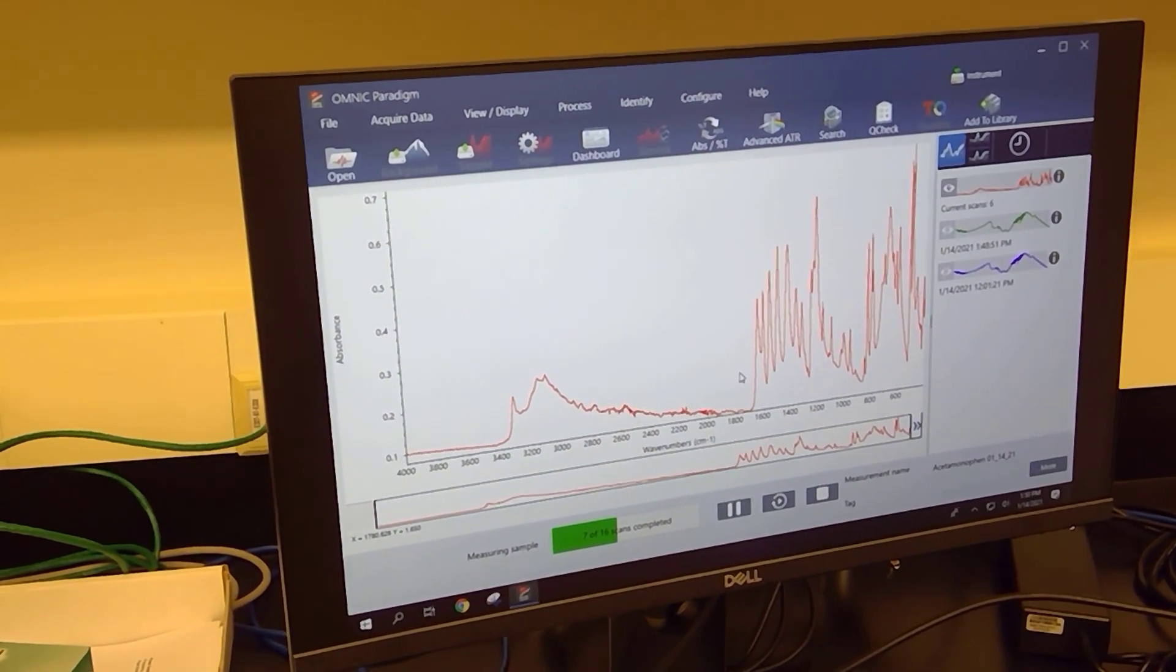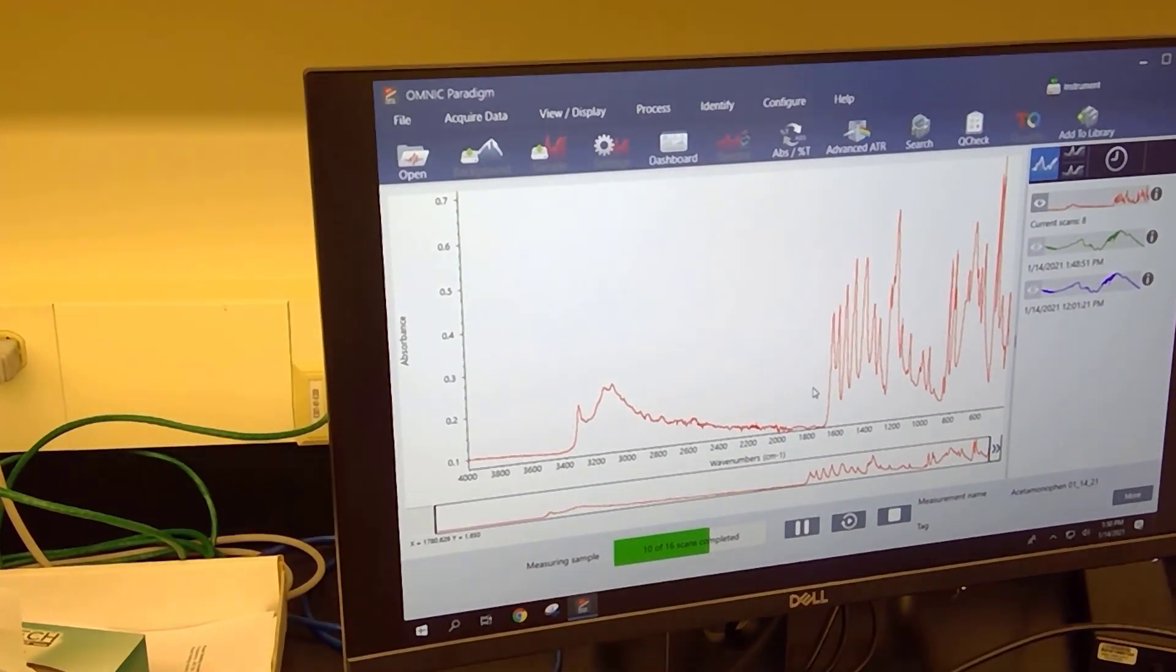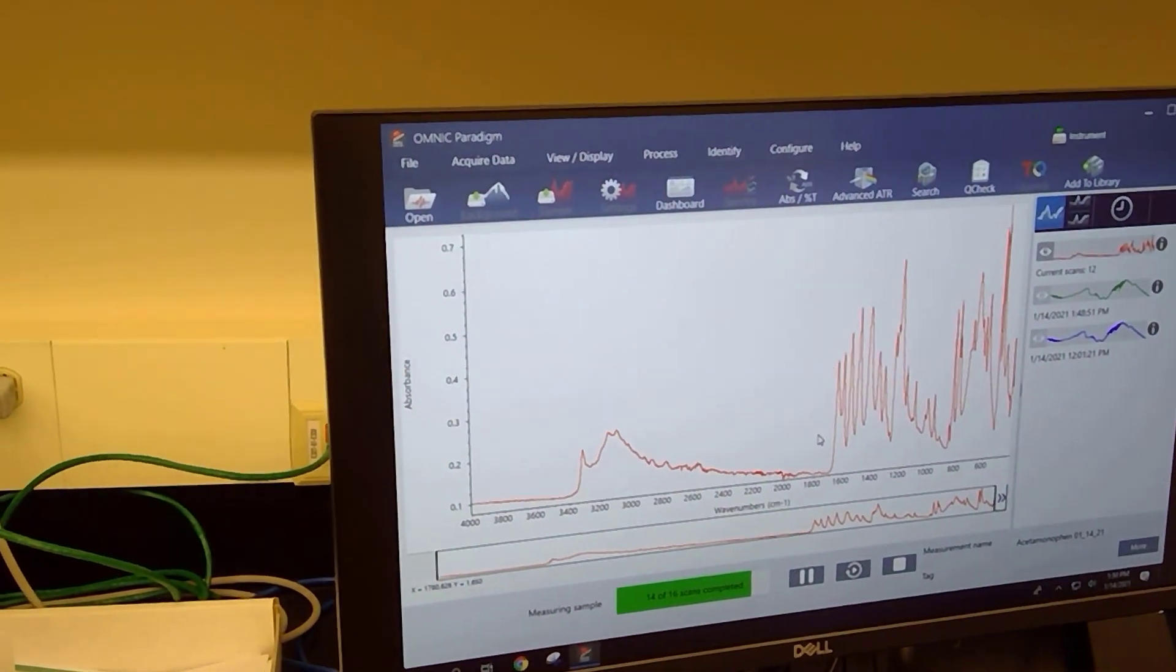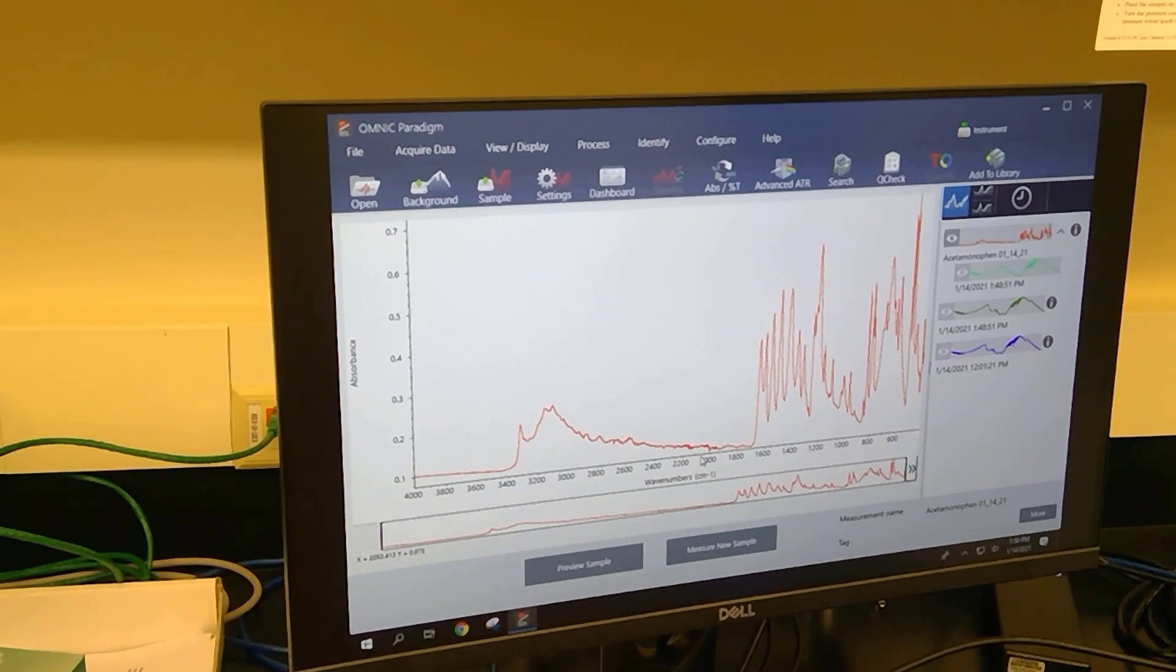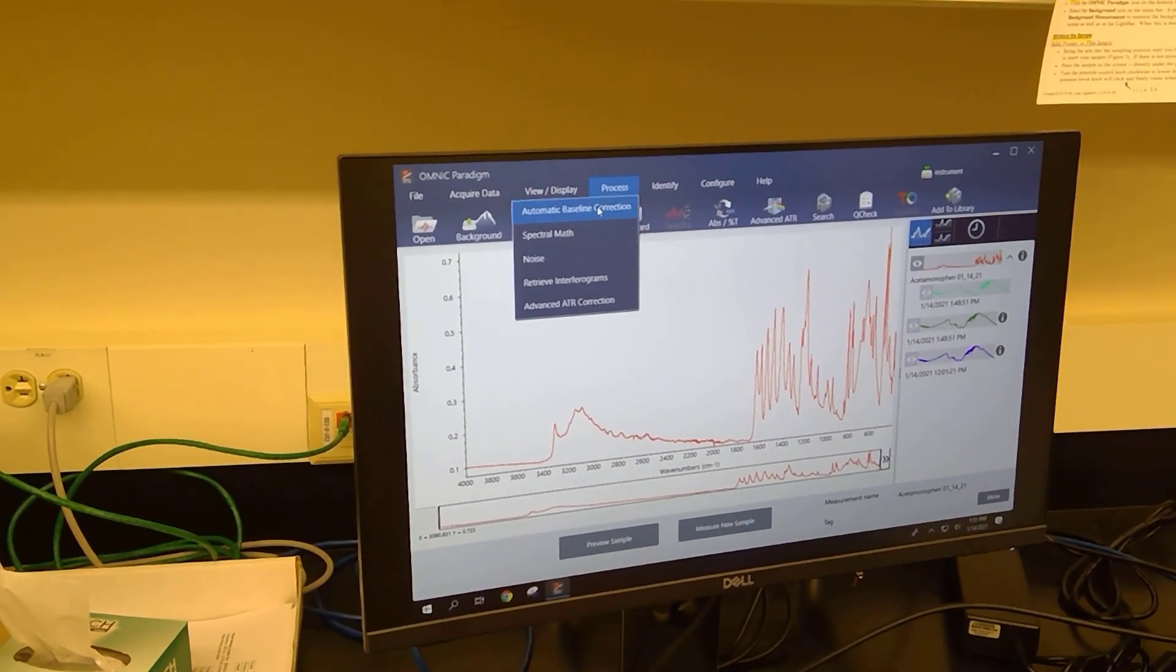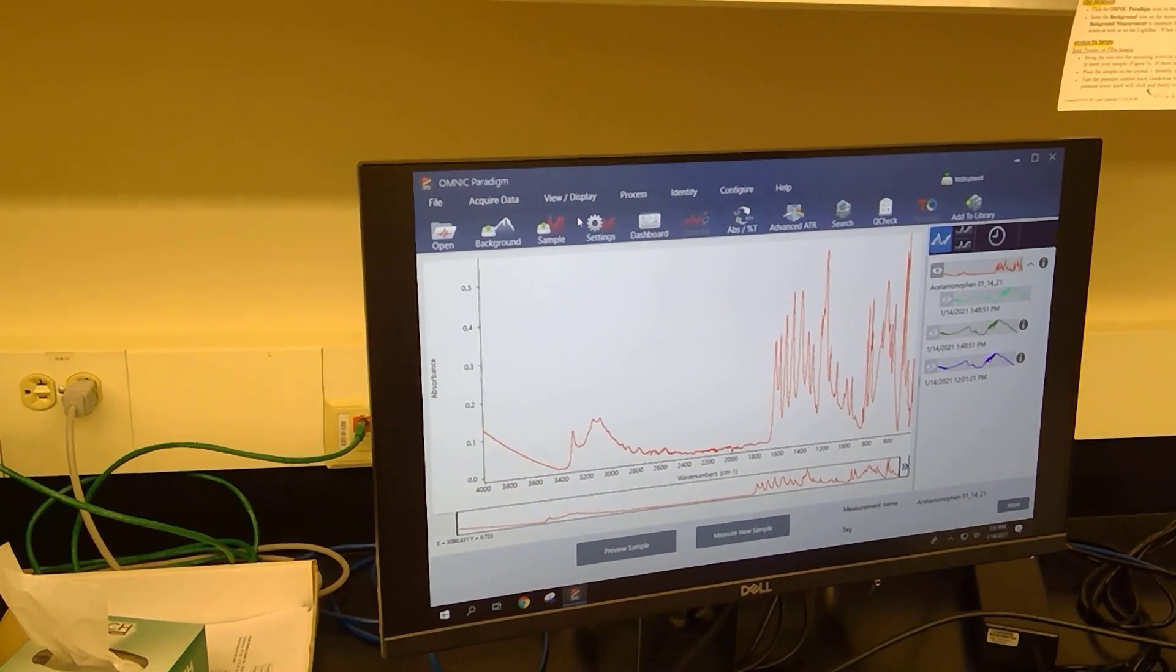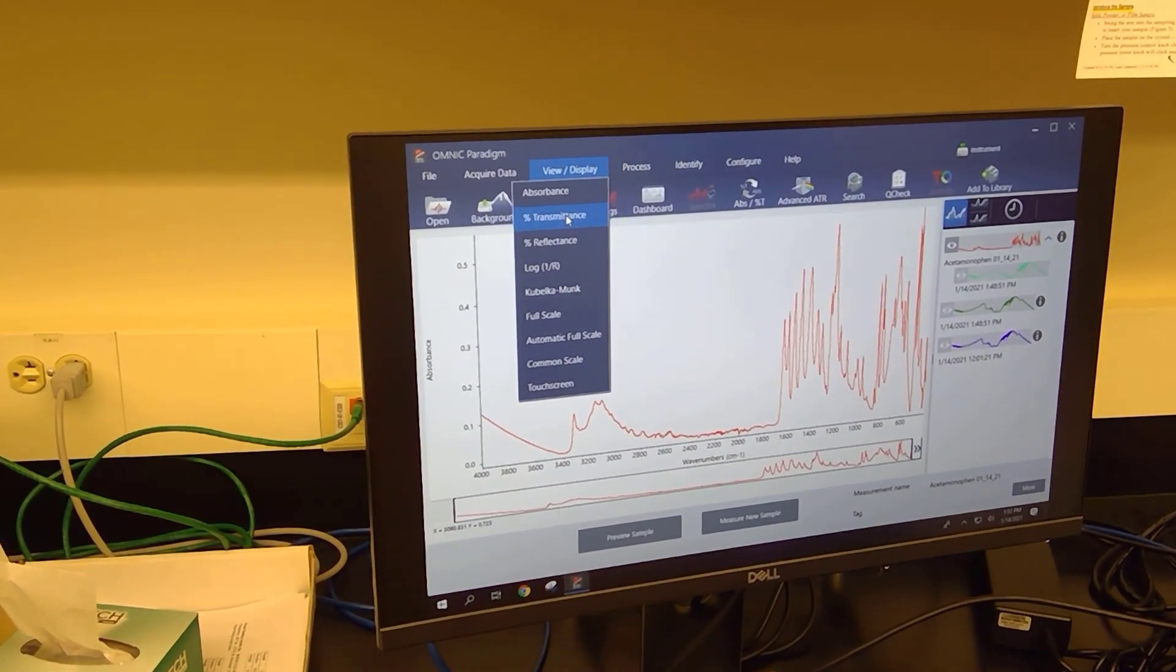This is looking good so far. At the moment the picture you see is inverted. We will put it in the correct direction as soon as it's done scanning. Now the scan is complete and I'm going to process our compound here. I'm going to go to the baseline correction and I'm going to absorb it into transmittance.